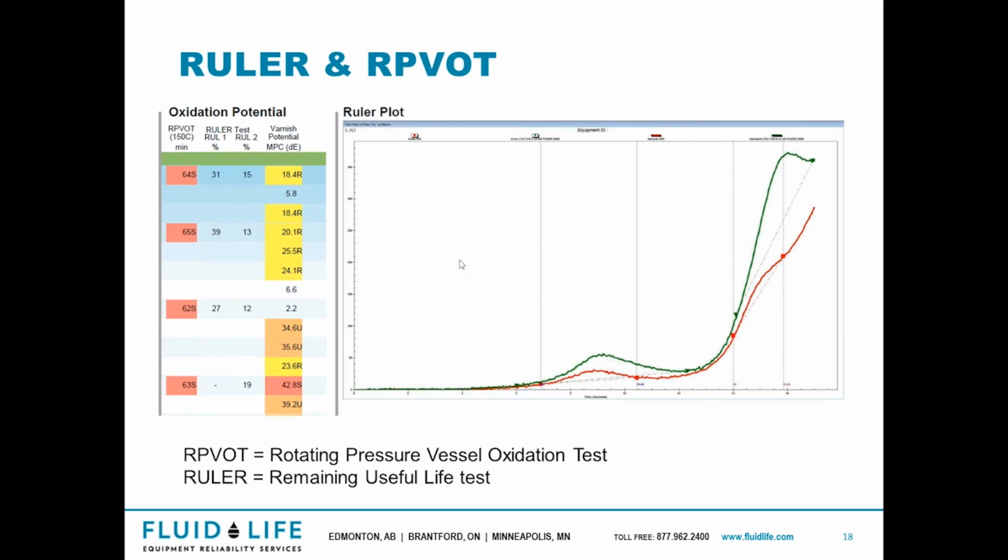So again, take these results with the rest of the results. Make sure you're comparing it all together, not just one aspect against another. But hopefully that's giving you a little bit of insight on the tests that we use for turbine oils.